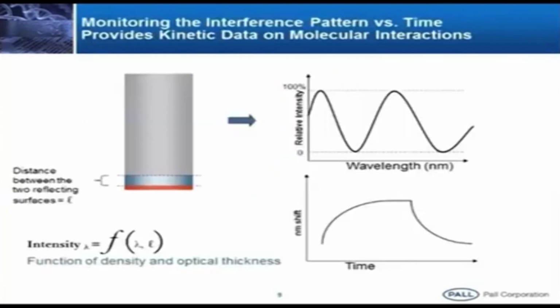Now, as the molecules start binding, in real time you can see a curve like this. This is what the readout is. This is the background, this is the readout. See, this is what we call the association phase. As the molecule starts binding to the binding partner, we can see the curve rises. We call this association.